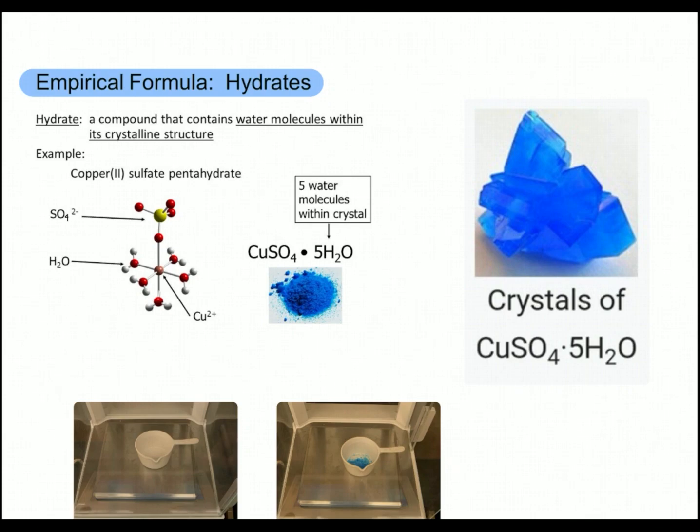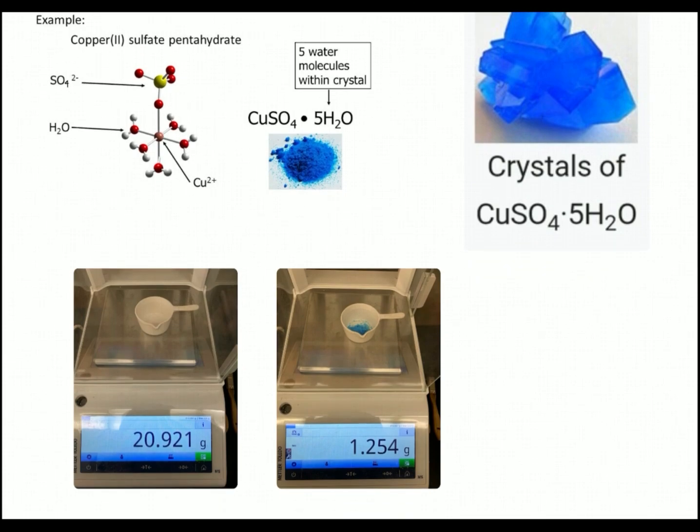As we cannot be in the lab doing this experiment, I'm going to walk you through what you would have done in order to collect the data necessary to determine the number of moles of water per mole of salt in a hydrated compound. First of all, what is a hydrate? It's an ionic compound that, when it crystallizes, traps water in between the cations and anions.